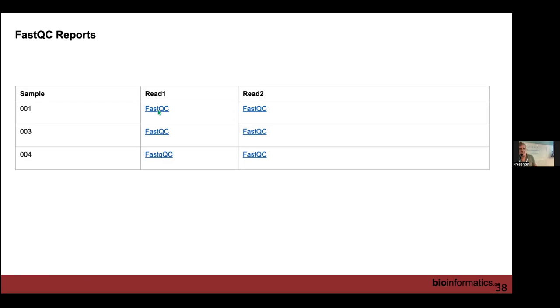I've enriched this file to show you what the FastQC report would look like if you're seeing a lot of adapter in there. And yes, you see a lot of changes. Suddenly we go from very high quality across the whole thing, I'll come back up to the top of the other one, to seeing lower quality scores in that later end. That's partially because of adapter, more likely because we're doing read-through past the adapter even and getting a lot of noise.